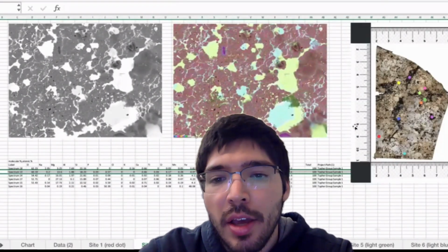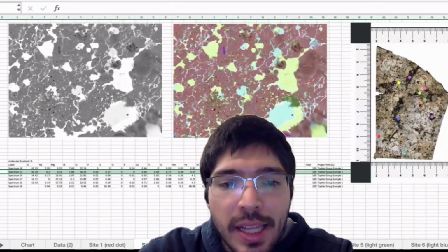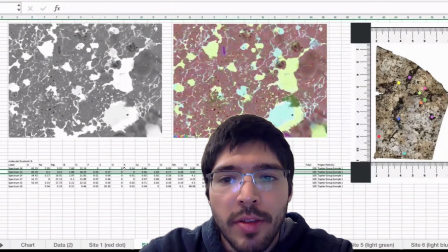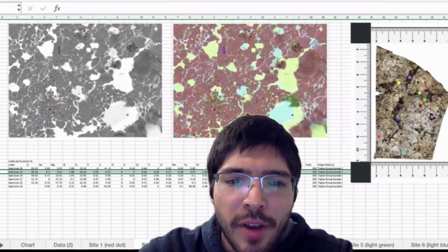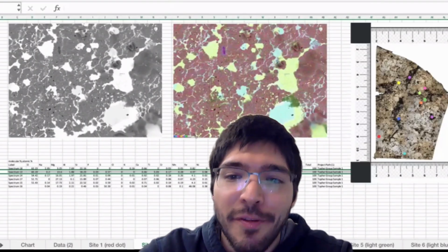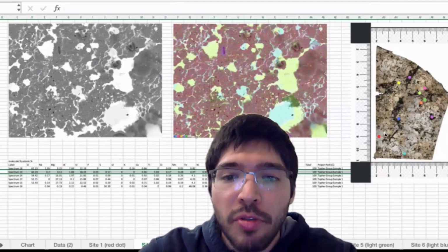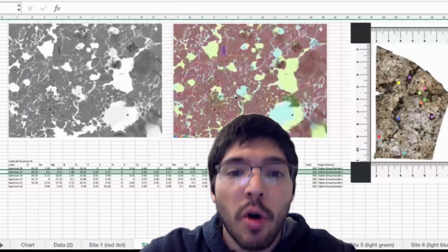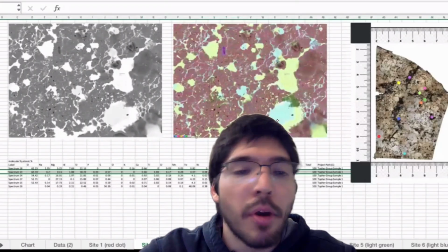So I could say within a few shock melt veins, a mineral phase that was chemically consistent with something like a majorite garnet was observed. But I wouldn't give the composition of it because I'm not very certain on that. And I wouldn't specifically say that it definitively is there, but I would imply that it may be there. So if someone is interested in shock melt veins and they want to see this particular meteorite, and they say, oh, there might be this mineral in there, then this might be a sample they want to borrow for research.